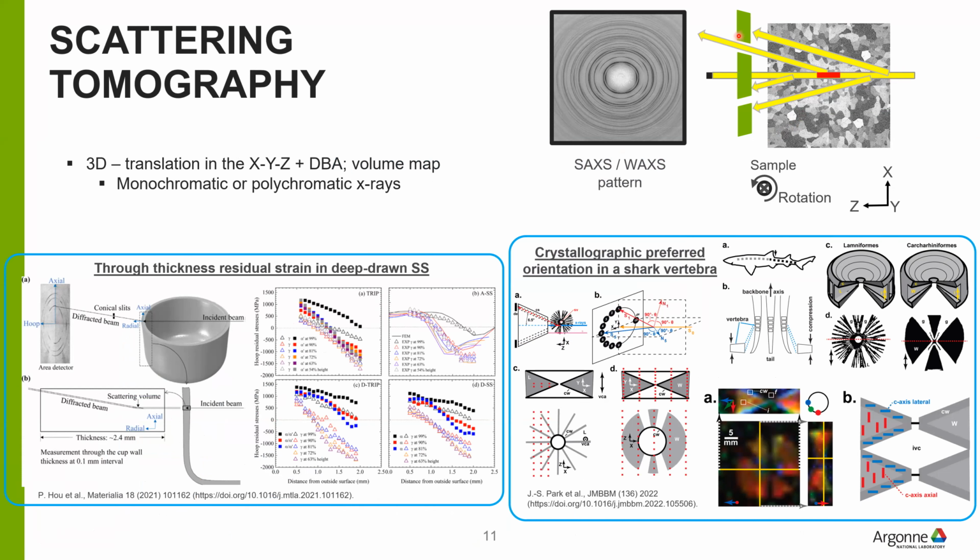One method is to place a diffracted beam aperture downstream in the experimental geometry, and selectively choose only scattering from a particular volume to go through and be detected on the detector. The other method, on the right here, uses energy dispersive diffraction to also isolate a subsurface volume in the material, and study the material that way.